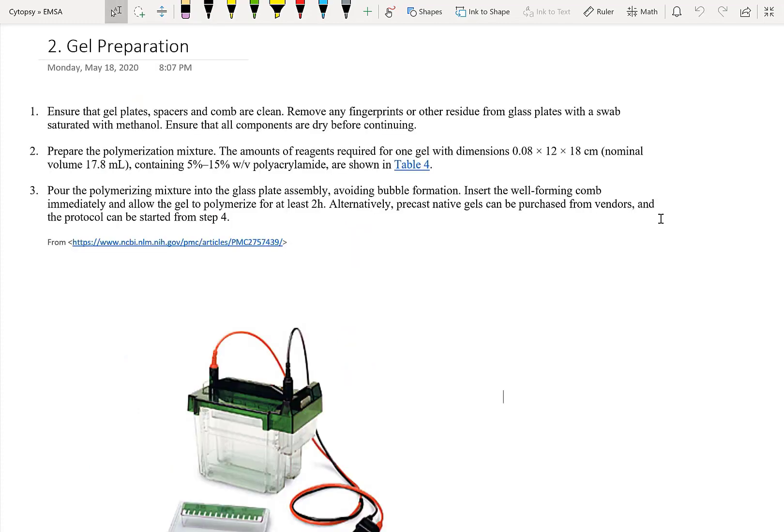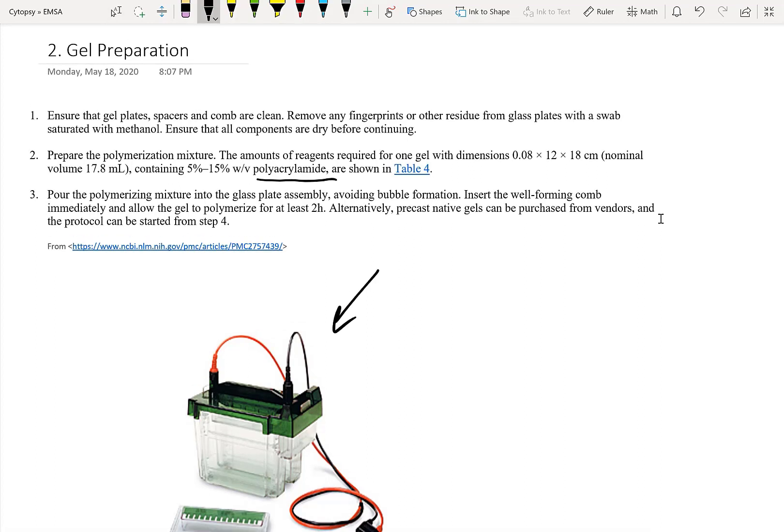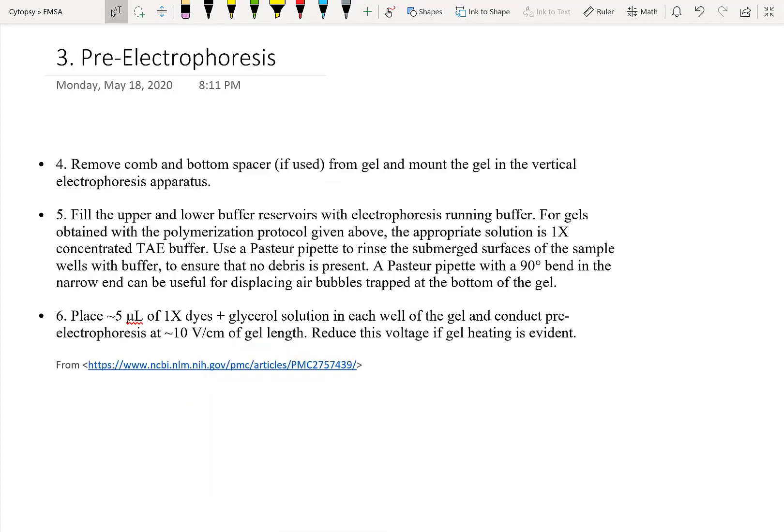We've got our DNA ready and it's time to prepare a gel. As you can see here, we're actually using a polyacrylamide gel. If you don't know what this is, you should check out what SDS-PAGE is. I've made a different video about it. Using SDS-PAGE, we were able to previously separate out proteins based on their size. In EMSA, we have to separate out protein-DNA complexes based on their size. So that's why it makes sense to use polyacrylamide here. Once you make your gel, you can actually simply store it at 4°C. I'm not going to go into the details of how to make a gel because I've covered that in my other video. In the picture below, you see what a gel electrophoresis apparatus looks like.